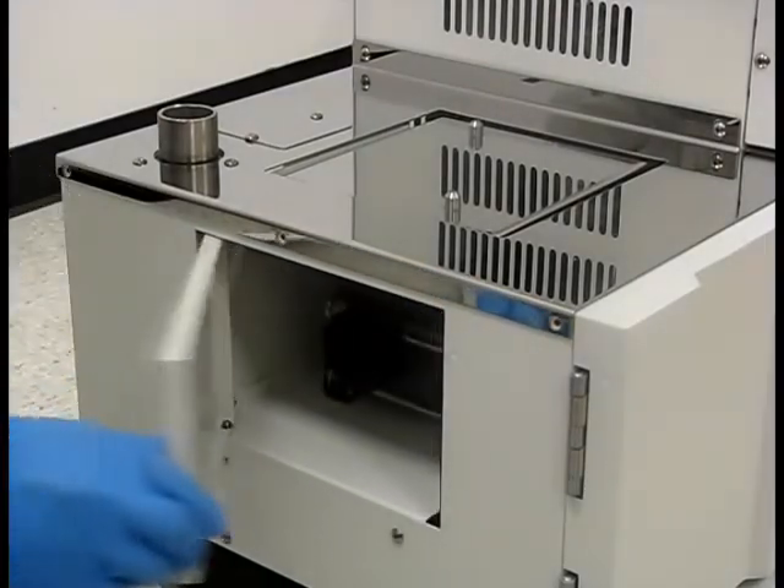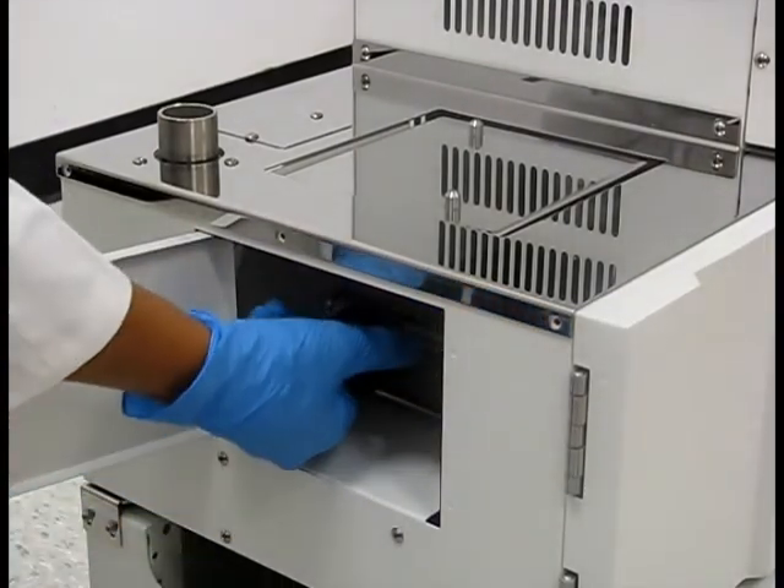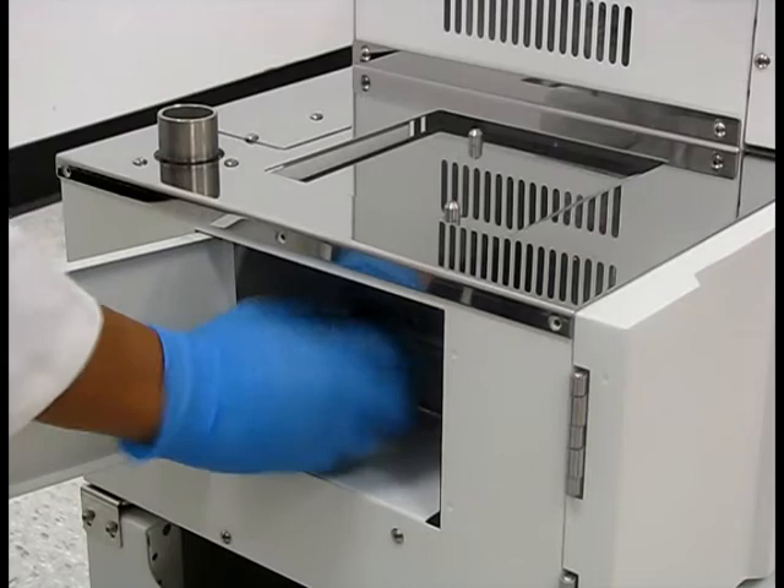Through the panel on the side, you can access the knob to adjust the height of the stage. Make sure it is lowered completely to prevent any damage to the drying chamber during installation.